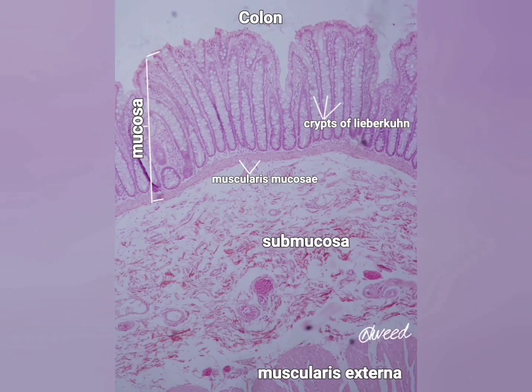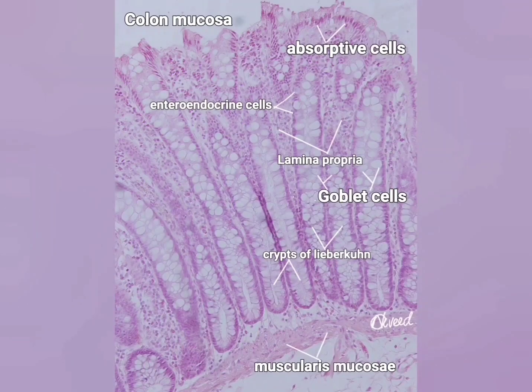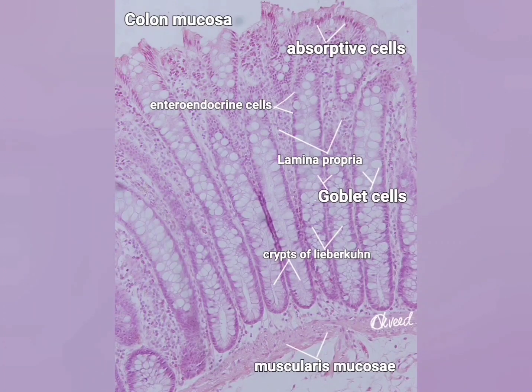The lamina propria contains a large number of crypts of Lieberkühn. Colonocytes and goblet cells are present in the upper one-third of these crypts, while the lower third of these glands are lined mainly by goblet cells. Some enteroendocrine cells and undifferentiated stem cells are also present in the deeper parts of these glands.